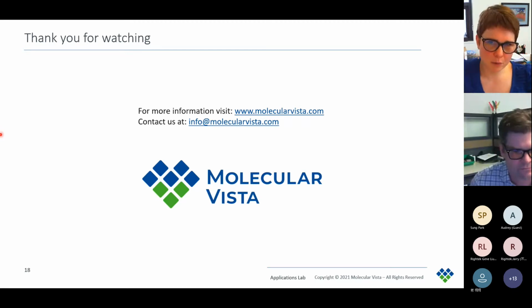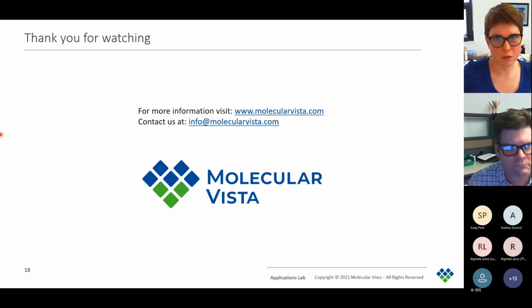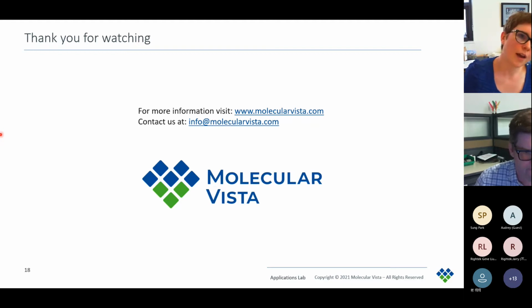We'll be keen to play around with this a bit. Maybe just trying to look at freshly fractured nacre is definitely something I want to try, and just see how everything looks without doing extensive treatments via polishing and so on, and compare results.